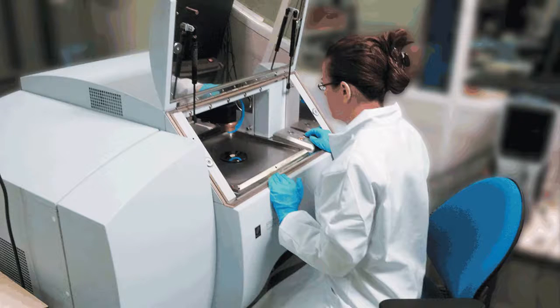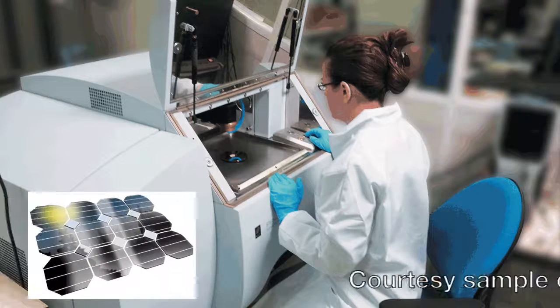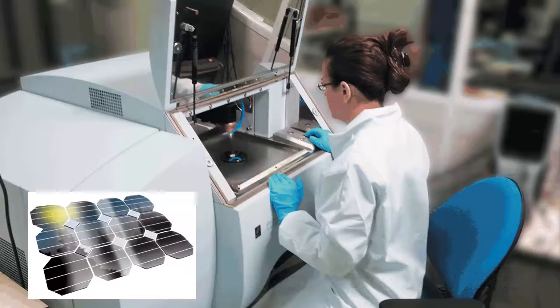Let's watch a video showing the analysis of a sample from the fabrication of a silicon-based solar cell, provided by the Solar Energy Research Center in Hannover, Germany.